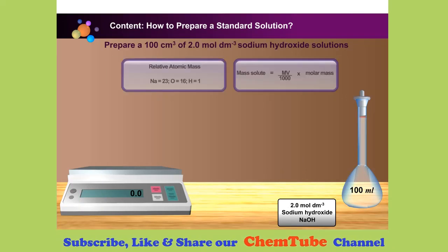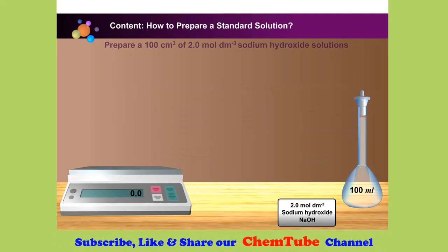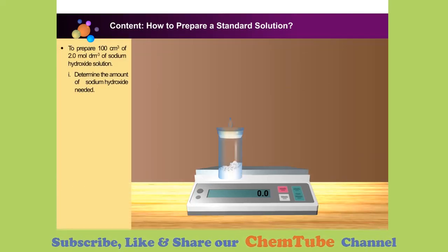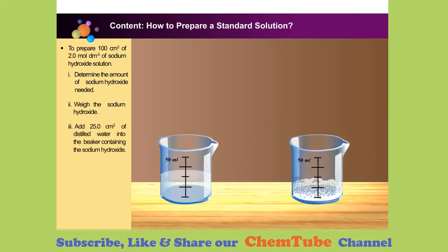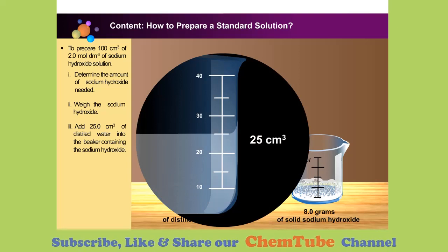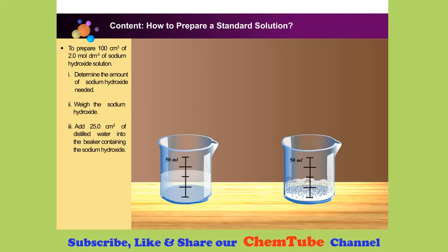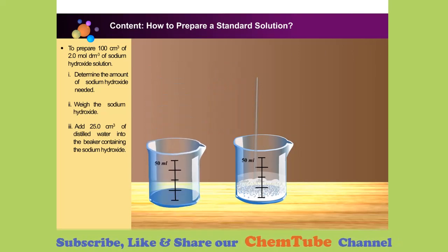First, calculate the mass of solute needed. To prepare the solution, weigh 8.0 grams of solid sodium hydroxide using an electronic balance. Add 25 cubic centimetres of distilled water into the beaker containing the sodium hydroxide. Stir the mixture well to dissolve the solid.